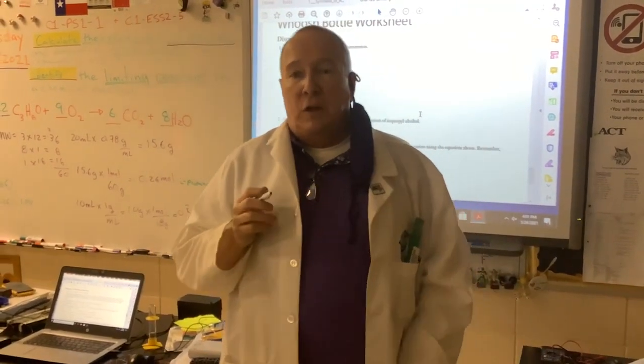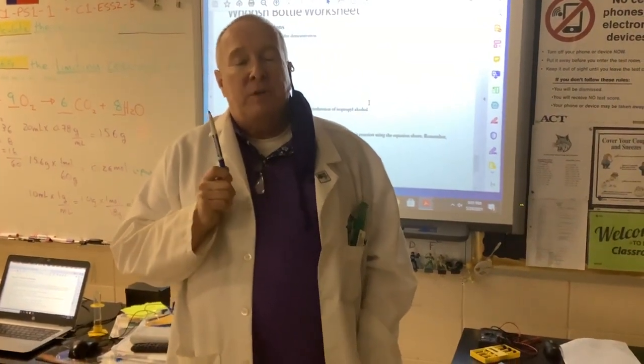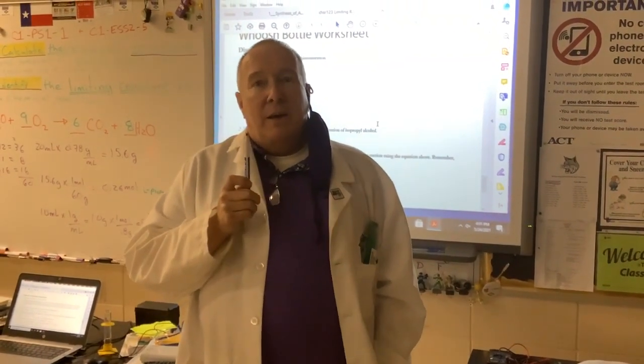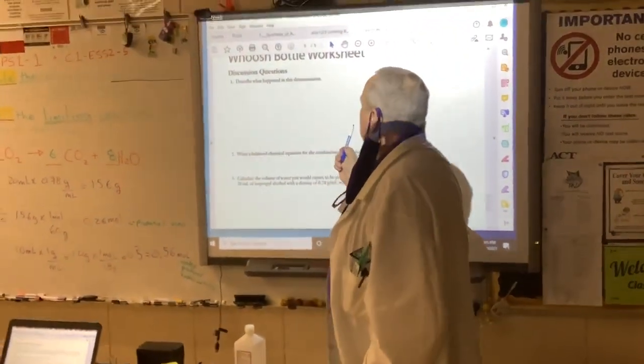You don't have to use 100% isopropyl alcohol. You can use other alcohols. Do not use methanol. The reaction would be too violent and potentially break the glass. But in this reaction, you saw the following. Now, the first question says, what happened in the demonstration?